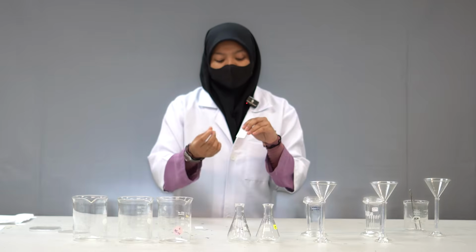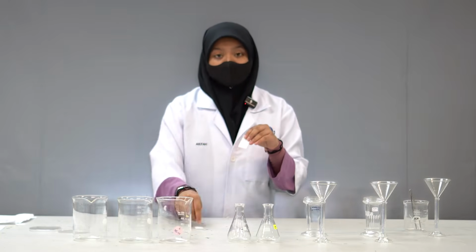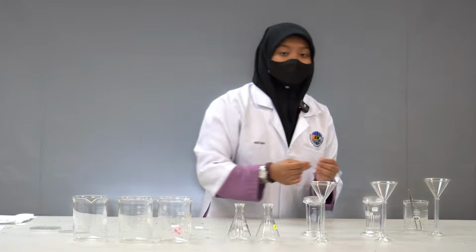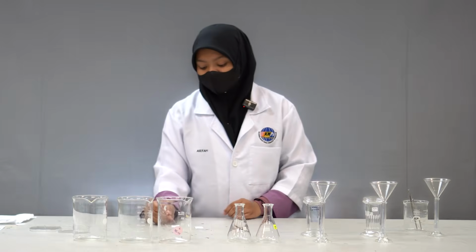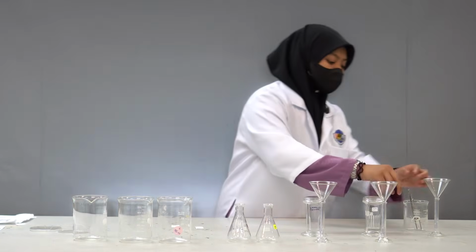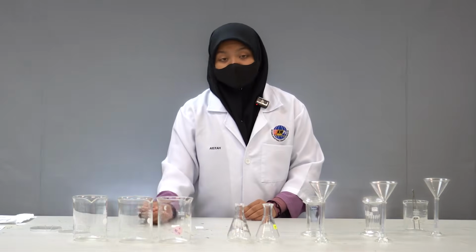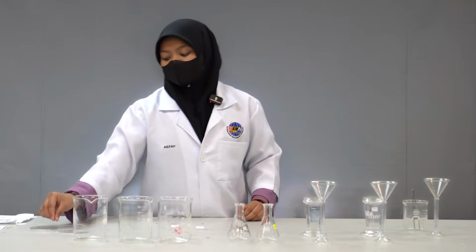So for the A, you just dip and spot onto the thin layer, for both thin layers, in the A section. For the second capillary tube, you take the base, and then you spot onto the B section for these 2 thin layers. With the last capillary tube, you take from the neutral solution and do the same thing. You spot onto the N section on these 2 thin layers.